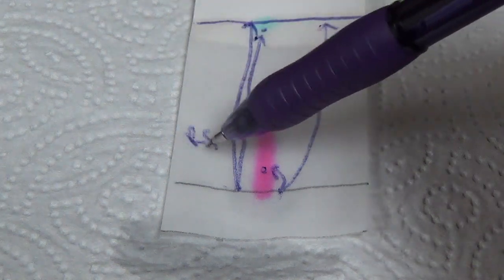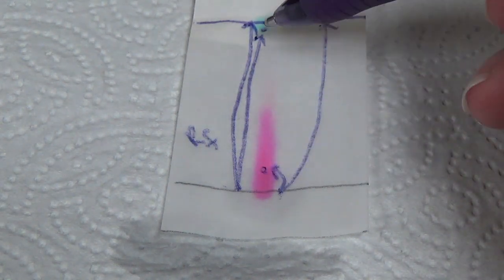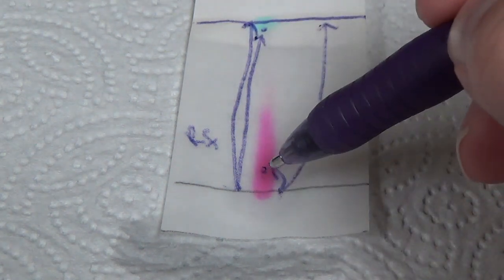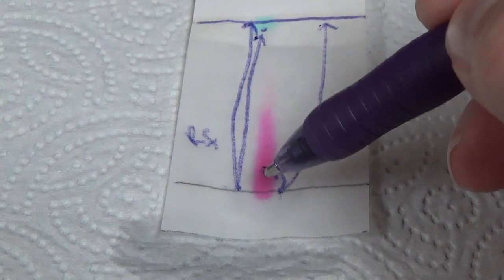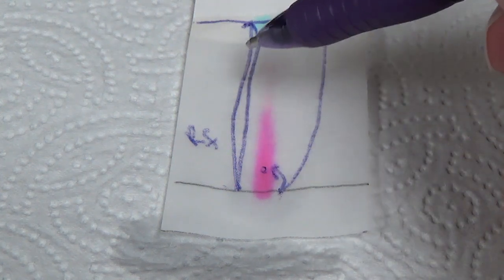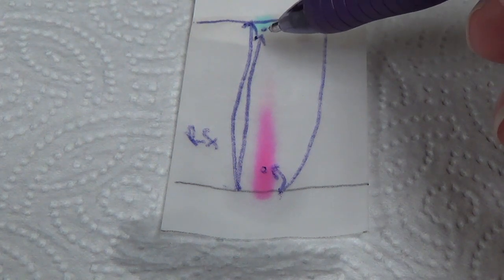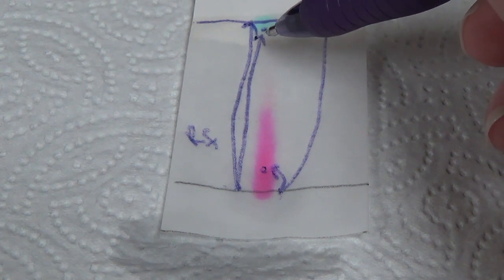And all an RF does is reference for us how well we were able to separate these. So you can notice a big separation. So a little prelude for tomorrow. Since the pink did not move a lot, it must be more attracted to the stationary phase, the paper, than the mobile phase, the water. And the opposite, since the blue traveled a lot, it must be very well attracted to the movable phase, the water, and not so attracted to the stationary phase.